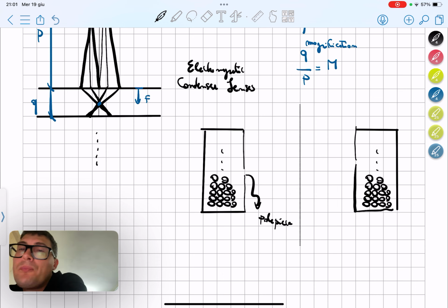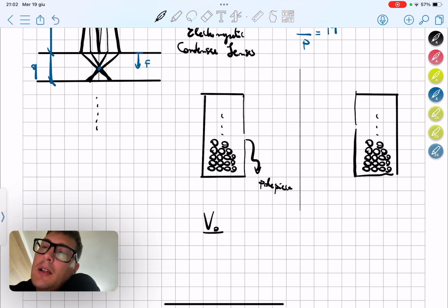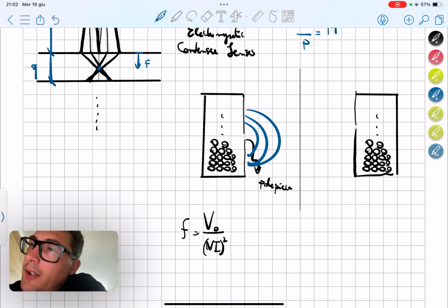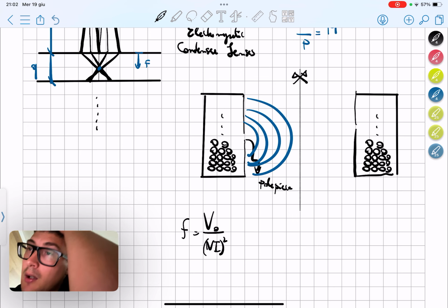Okay. So these wires will have a current crossing them, and this creates, by the Biot-Savart law, a magnetic field. We will comment a little bit later about this equation, but effectively they are creating a magnetic field. I will just draw one part of this drawing, it's symmetric.